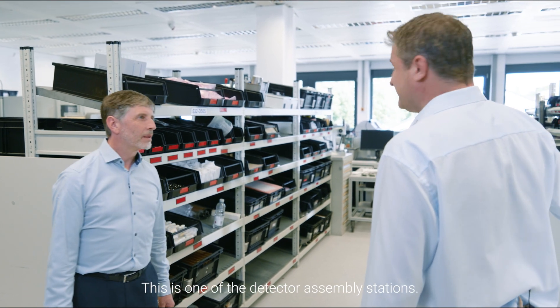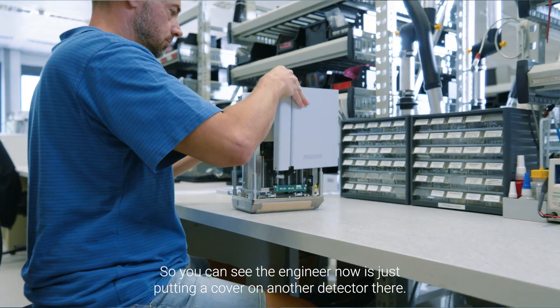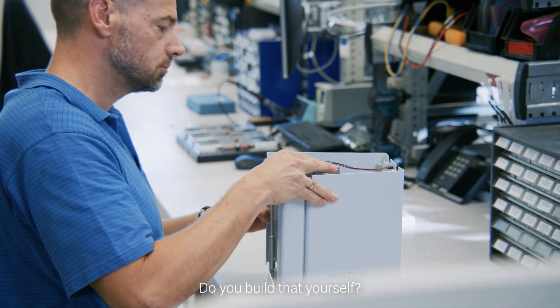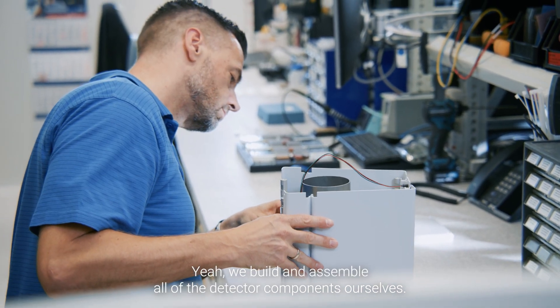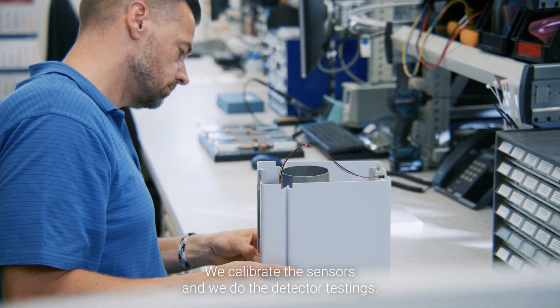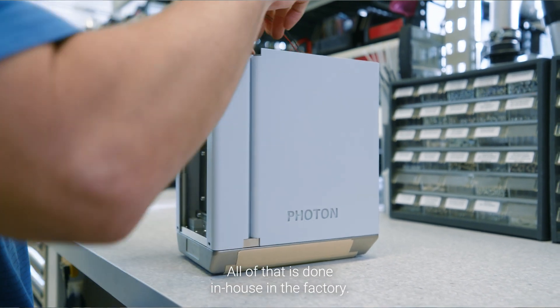This is one of the detector assembly stations. You can see the engineer now is just putting the cover on another detector there. Do you build that yourself? Yes, we build and assemble all of the detector components ourselves. We calibrate the sensors and we do the detector testing. All of that is done in-house in the factory.